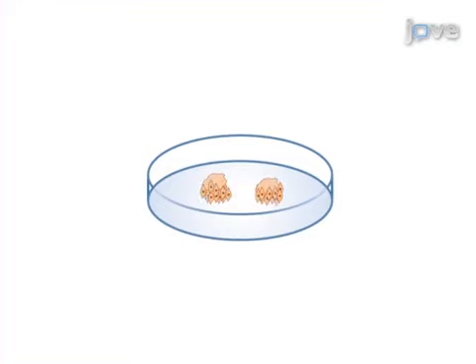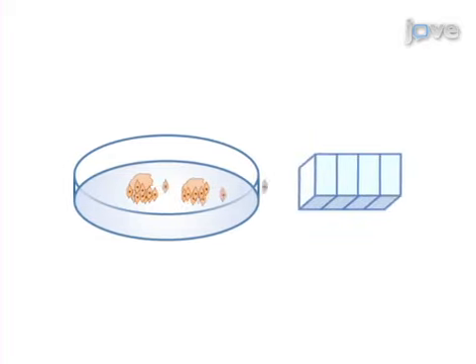First, human fibroblasts will propagate from the skin sample within the first 2 weeks. Next, the fibroblasts are detached and seeded into chambered cover glass wells.